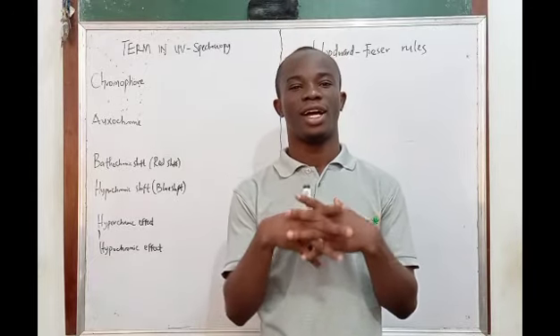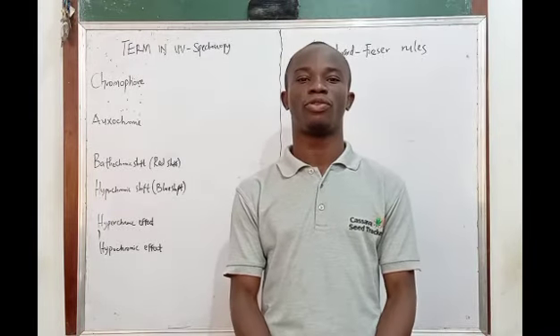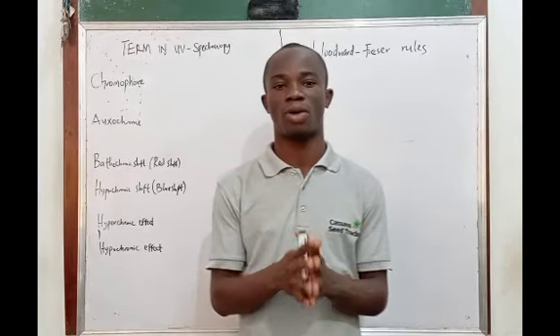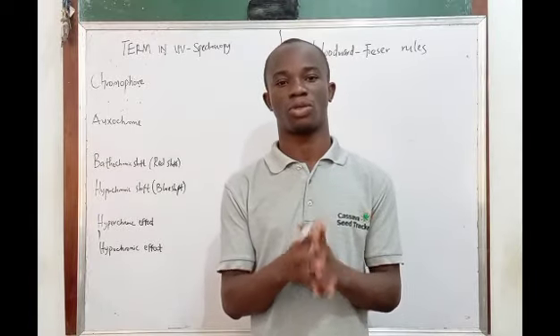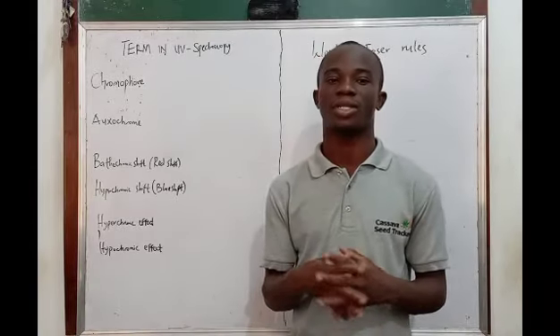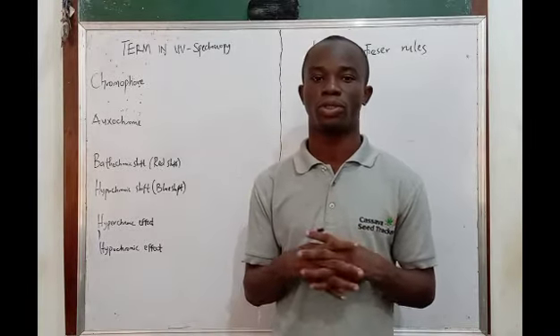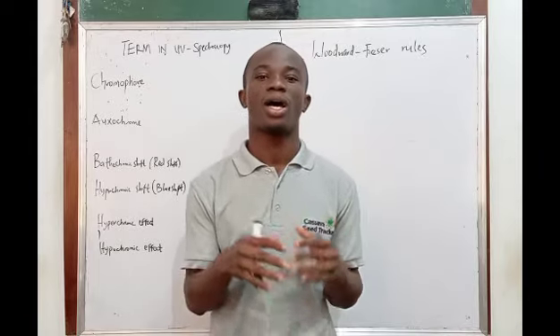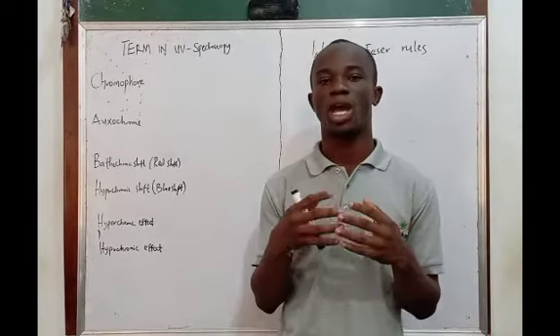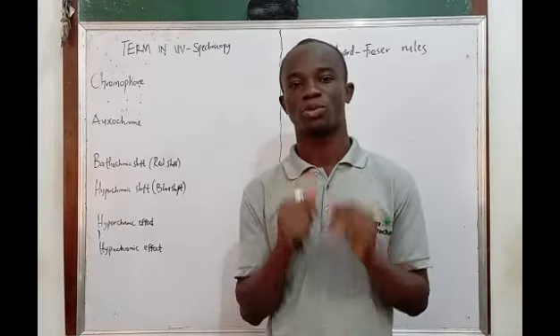Hi everyone, I want to welcome you to another section, and in this video I'll be moving forward on some of the things we have discussed on UV ultraviolet visible light spectroscopy. In this particular video, what we want to talk about is terms that are used some of the times that are important for us to know in UV spectroscopy. I'm going to be highlighting these terms and giving explanations and things that we have to know about them, which will help us in subsequent things that we're going to learn under UV spectroscopy.